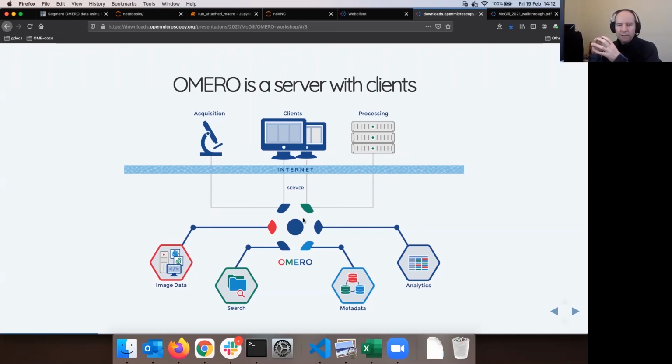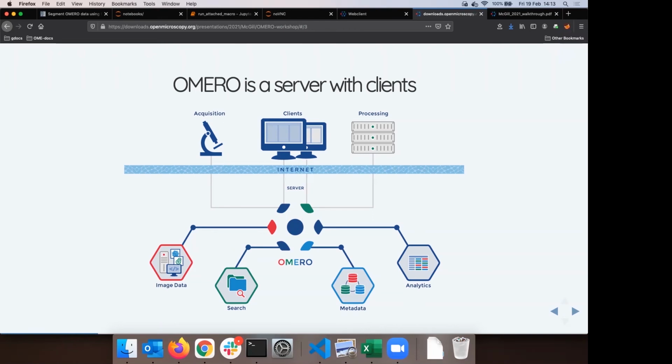So you have to have a mental image of something like one Omero server per scientific institution or more. It depends, of course, on how big the scientific institution is and how many servers do they want to have, etc. What influence or say has the Ome team on that? Well, if Ome team is asked a question by the institution how to do that or how not to do that on a forum, then Ome team will answer that question. But that is it.